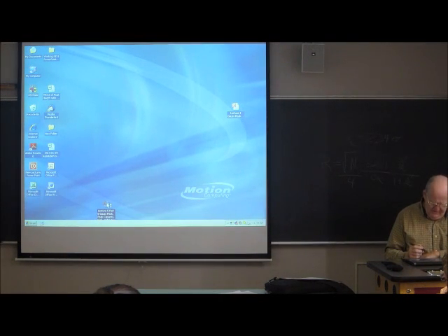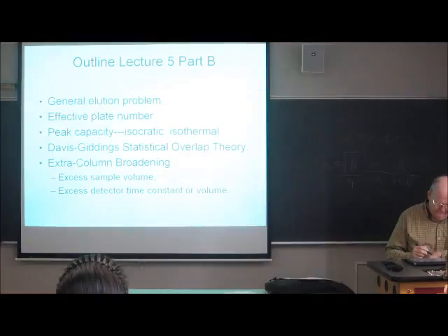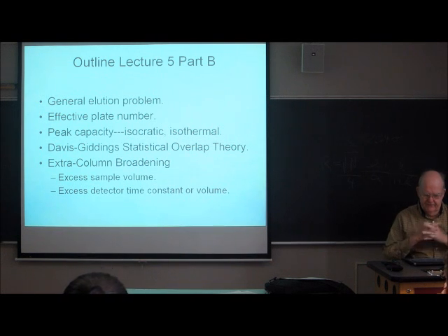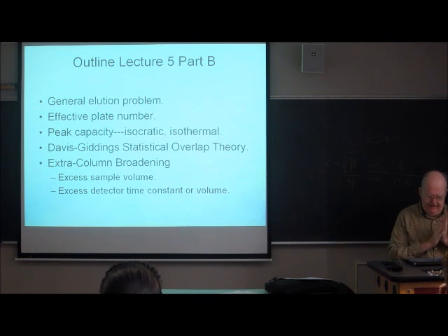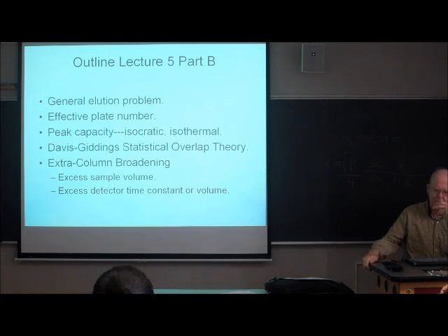Good. So now, let's get on to the next material. And the next issue to take up is what's called the general elution problem. And I'll describe that in a minute. And then we're going to get into some somewhat deeper theoretical issues. Not that they have no practical significance, they do have practical significance, but they're somewhat more advanced topics.